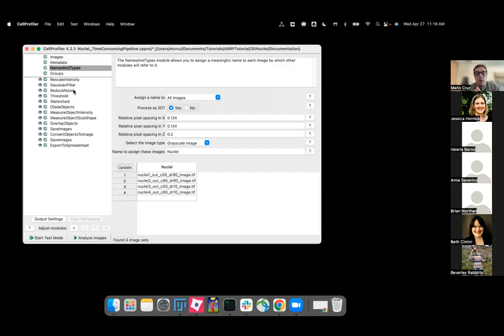All these 3 modules will pre-process our image, to then provide a segmentation that will be done with the threshold and watershed modules. Then we can provide the measures and then convert objects to images, save images, and overlay objects just to have a visual result.